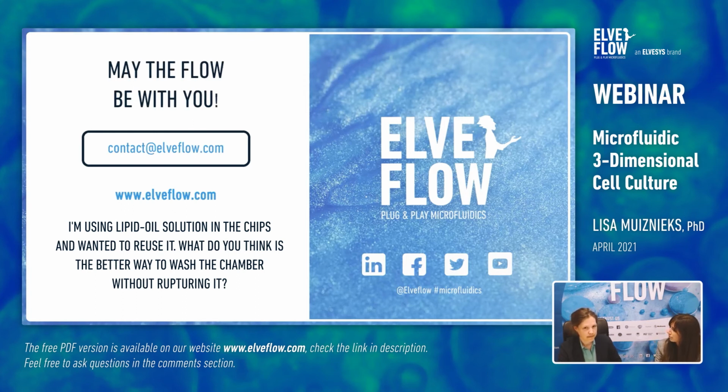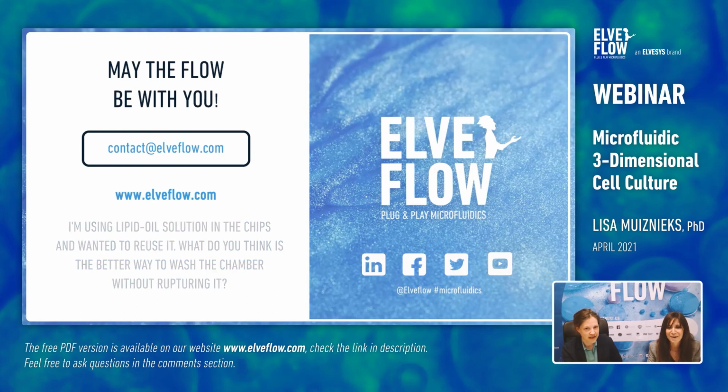I don't know if you Lisa have a specific tip for that in particular. No, that's how I would wash the chip for cell culture. So I'm not quite sure, again, your protocol for the lipid oil solution, if you can remove it from the chip, wash the chip and re-put it back in. I'm not sure. Yeah. Maybe trying with just first disinfectant and then water and ethanol, and let's see.